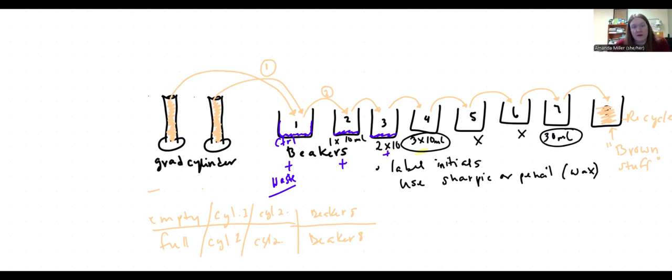We're going to use all of our regular PPE for this because it is a little bit hazardous. But it's really important to do this part of the experiment and refer back to it in our future experiments because it is all about error, uncertainty, parallax, contamination, all kinds of errors that we can prevent in the future or that we can't prevent, like uncertainty.